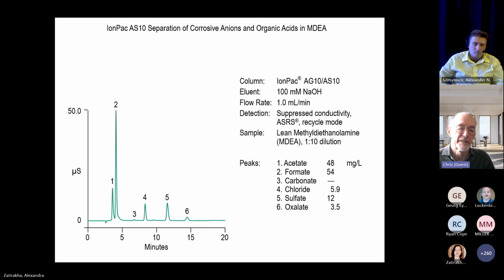Now, the idea was to make a hydroxide eluent column that would give a good isocratic separation of common anions with fluoride well separated from the void, based on the fact that the separation of hydroxide, a monovalent species, relative to divalent species is partially a function of the phase, but partially it's a function of the eluent concentration.